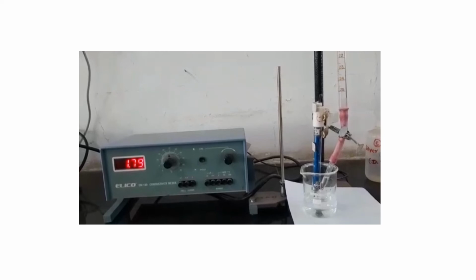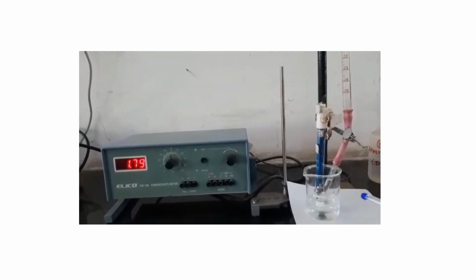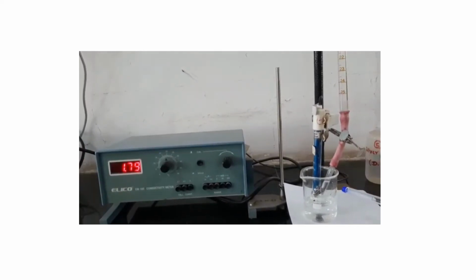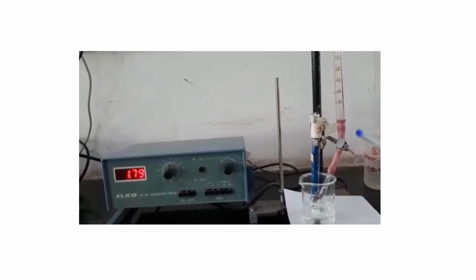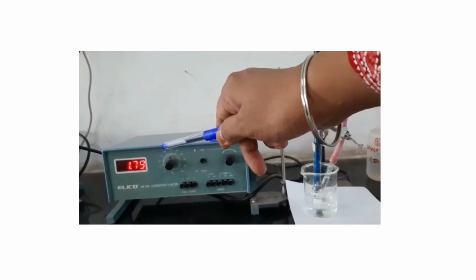Now we'll start the readings. Here, without addition of NaOH, that is 0 ml reading, we have to note down first. Here it shows 1.79.